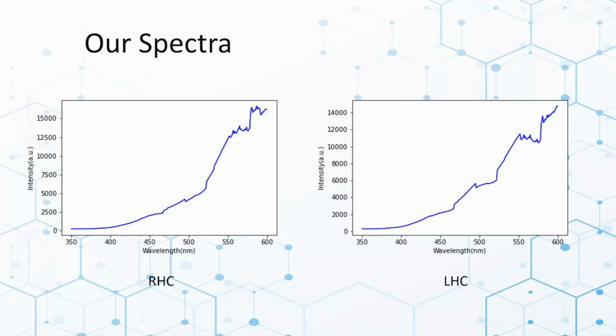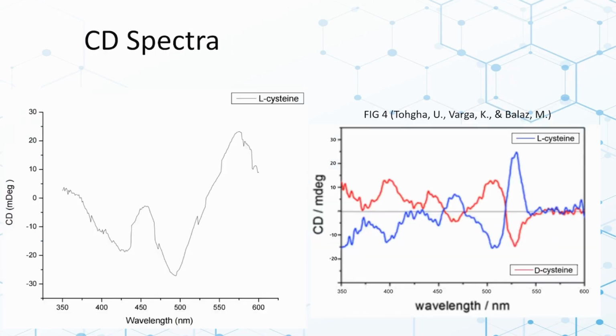Here is our spectra. The plots are the averaged intensity distribution of the 5 groups of original data we collected. Here is our CD spectra after processing the average intensity distribution as we mentioned above. For easier understanding, the difference we discuss below refers to the absolute value of the difference in absorbance. Through analysis of the CD image, our findings are as below.